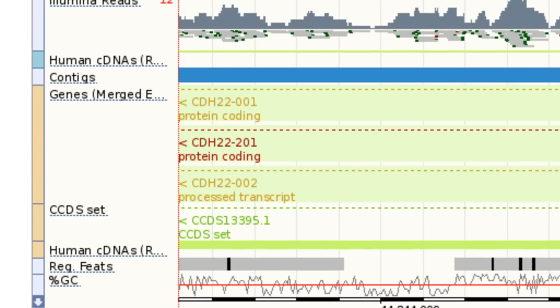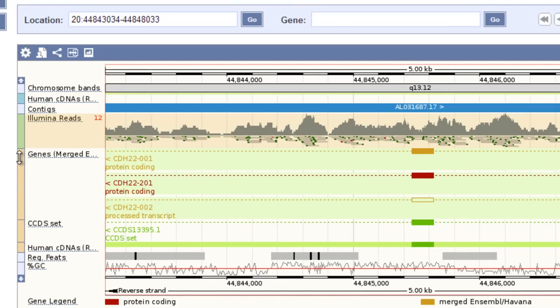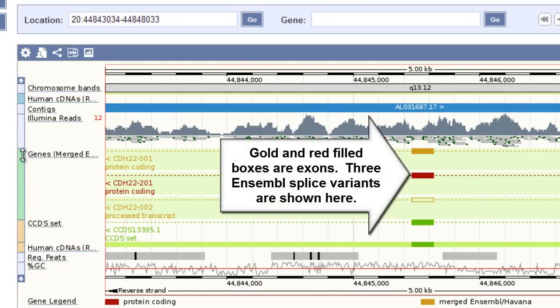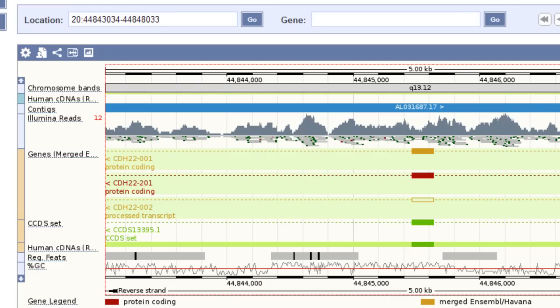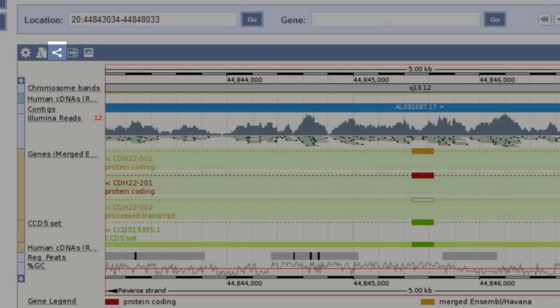I can also move the tracks around. For example, if I want to compare the Illumina reads directly to the gene, I can move it down next to CDH22. Once I finish my customization, I can either save this panel as an image or share it with a collaborator.